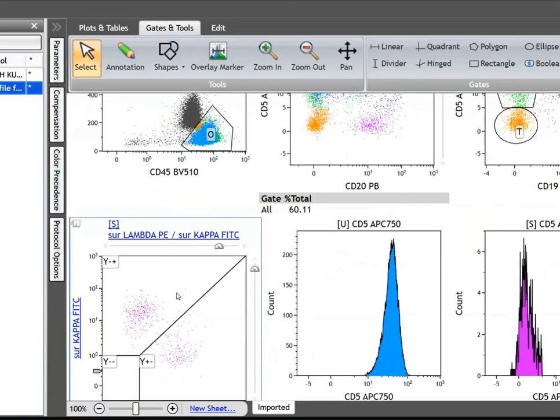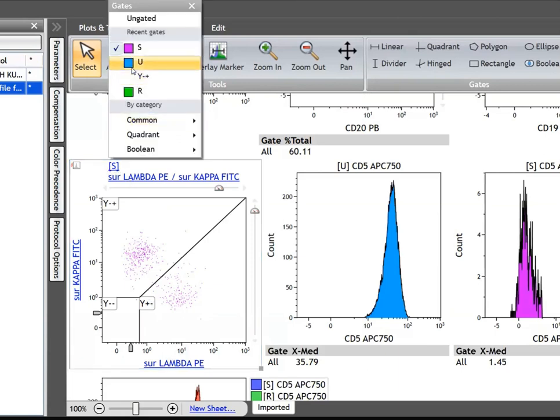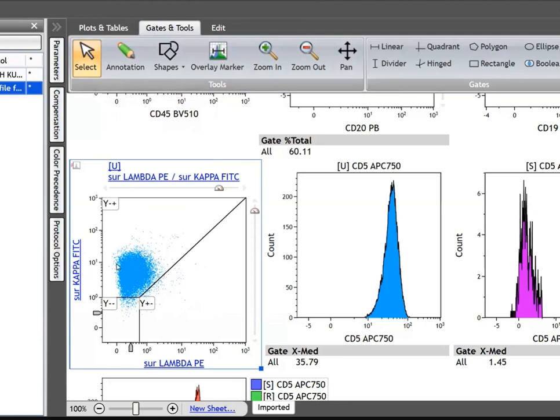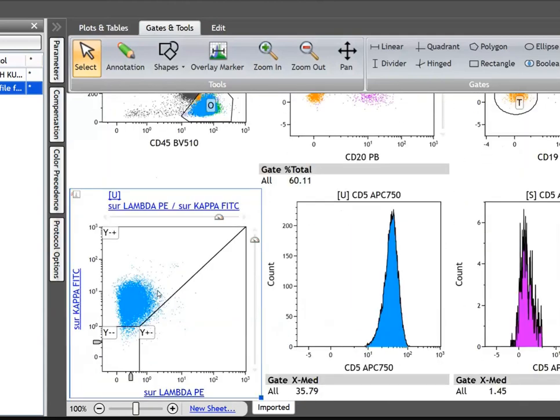It arises from a single cell, and that's what we call clonal. So these neoplastic cells will be either fully expressing kappa or fully expressing lambda. It will not split like this. In this case, if I put this neoplastic population, it is completely kappa positive. That is what I call kappa restricted, and it is lambda negative. That confirms its clonality, a monoclonal neoplastic population.